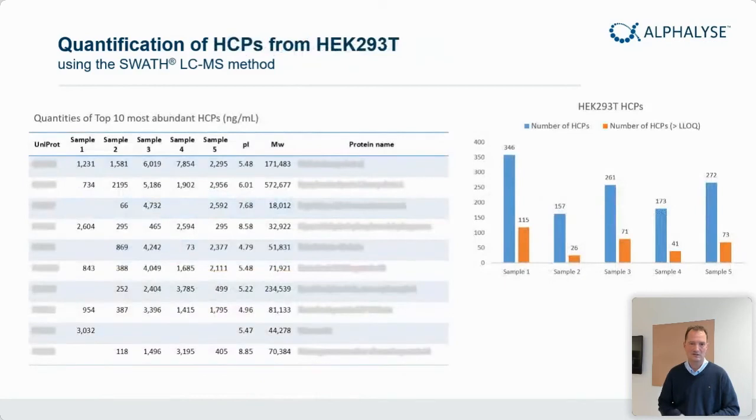We also looked at the host cell proteins from the HEK293 cells, and from the table here again, you can see a long list of different proteins in the different samples.